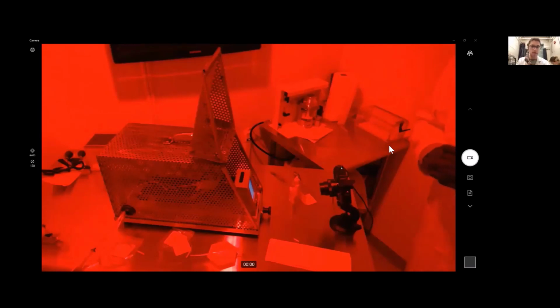Okay? Yes. Quick question, just following up on the red overhead light. Does the intensity of that overhead ceiling light matter? The intent depends on the distance and on the room. The one we are using is a 10-watt LED. I think it's less. I want to say it's 2.5. Oh, I apologize, 2.5 watt. Okay, so a very low wattage bulb.